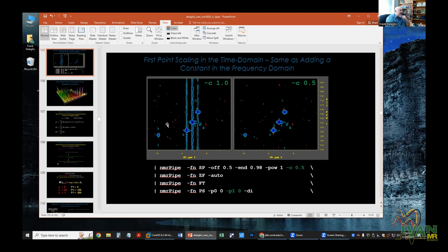However, if you do any kind of baseline correction after the Fourier transform, that has the effect of potentially fixing this incorrect processing. Right, but it's proportional to the size of the peak, right? That's correct. So the baseline correction will just move everything basically. Yeah, since separate baseline corrections are applied to every one-dimensional vector, the different vectors will get different amounts of baseline correction applied. So if it's a good baseline correction method, this spectrum will be correctly compensated. Well, thank you very much.